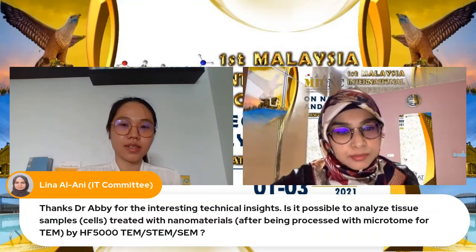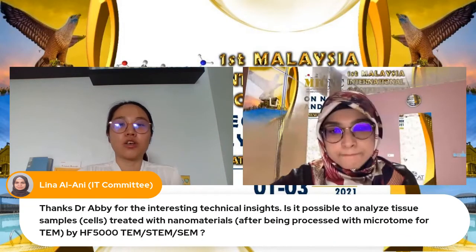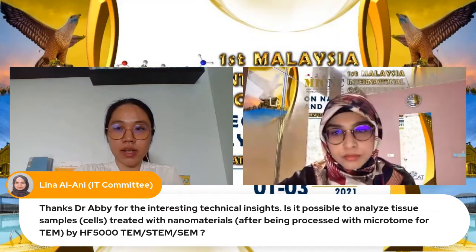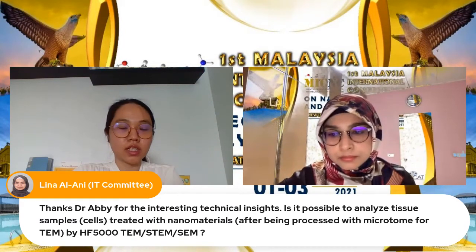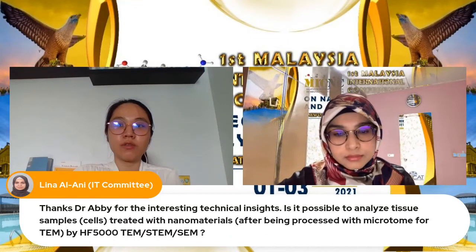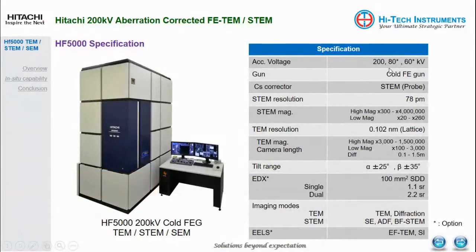Yes. Thank you for your question. For the TEM itself, it's actually the basic capability it can achieve. Because for this HF 5000, sometimes for your sample, if let's say it's beam sensitive, if 200 kV somehow is too high for your sample, you can reduce the kV to 80 or 60. So the short answer is yes, you can analyze your sample.